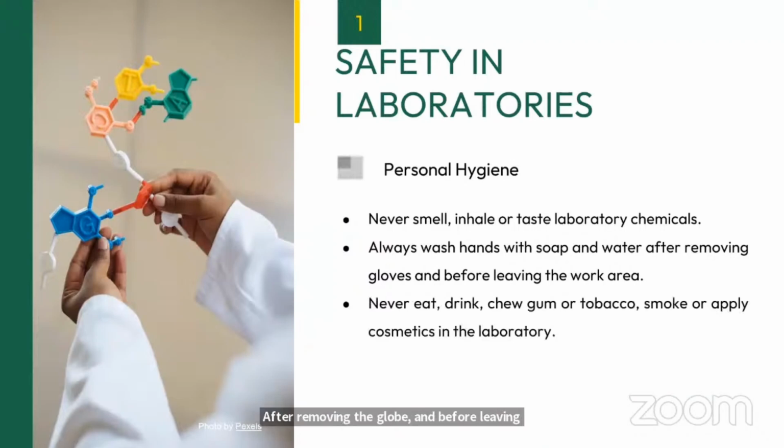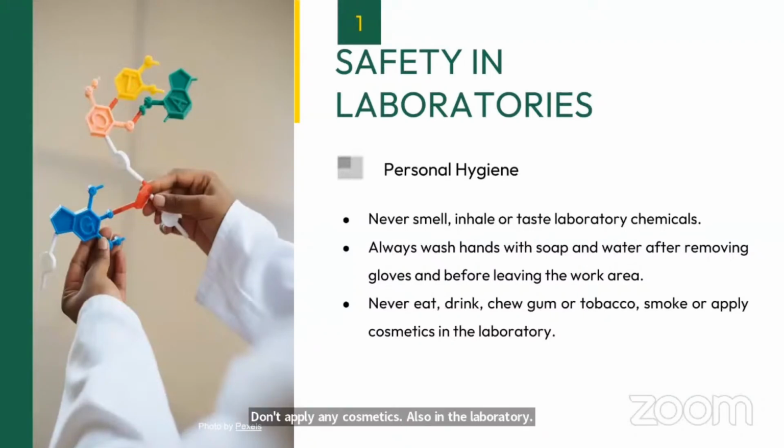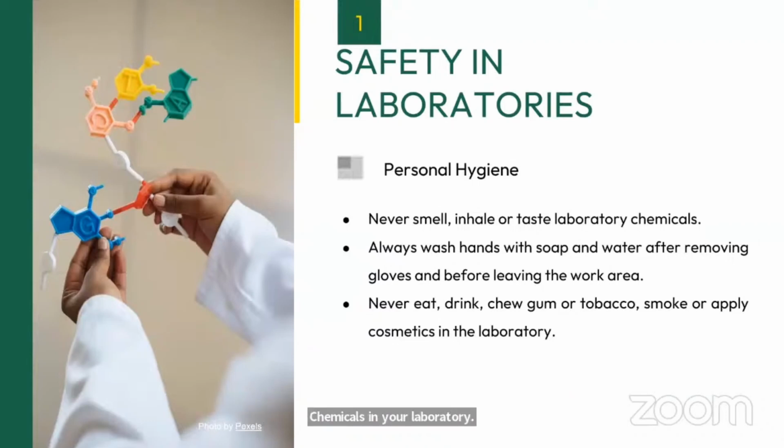Never eat, drink, chew gum or tobacco, smoke, or apply cosmetics in the laboratory. Don't apply any cosmetics in the laboratory, because cosmetics are basically certain chemicals. They may react with chemicals in your laboratory. It may cause certain reactions or allergies.